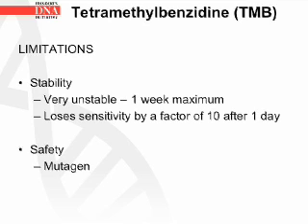The reagent is very unstable. It can only be used for 1 week maximum, and it loses sensitivity by a factor of 10 after 1 day. TMB is also known to be a mutagen.